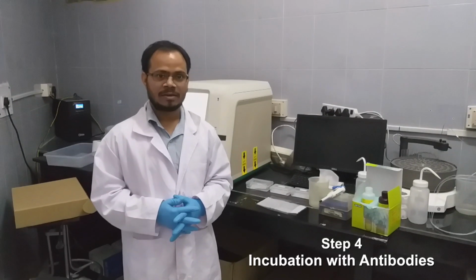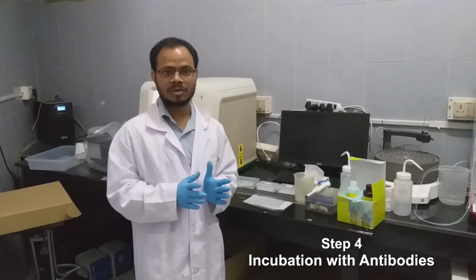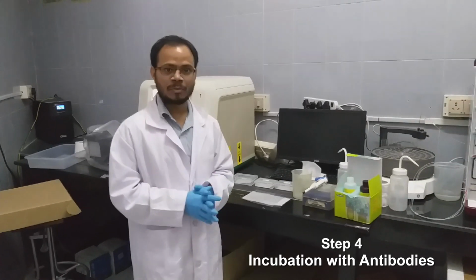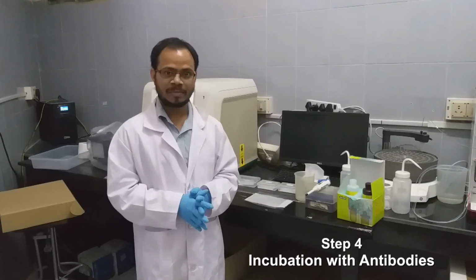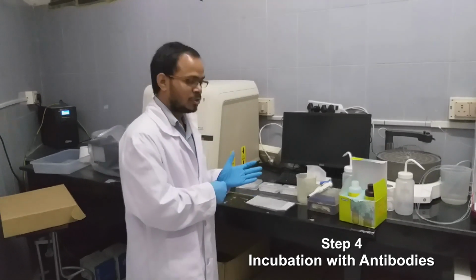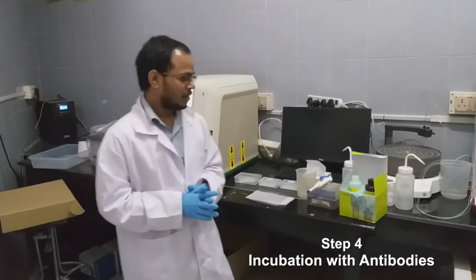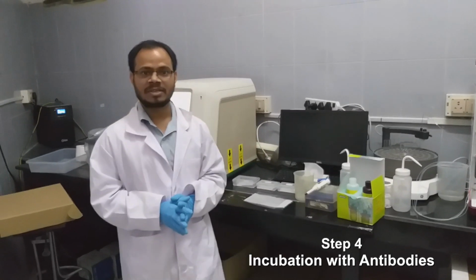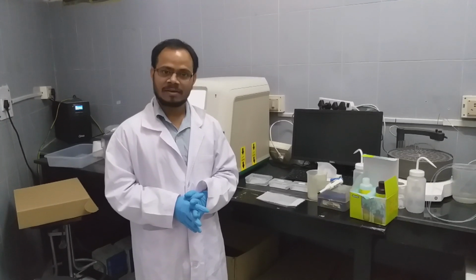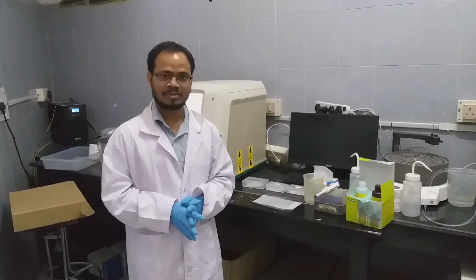In the earlier video on how to do Western blot, we showed how to transfer the proteins to the membrane. We incubated with the primary antibody, then the secondary antibody, and washed thoroughly. Now here we show how to develop a blot. For developing a blot, we need a chemiluminescent substrate. In most commercially available kits, luminol is one of the substrates used for this purpose.